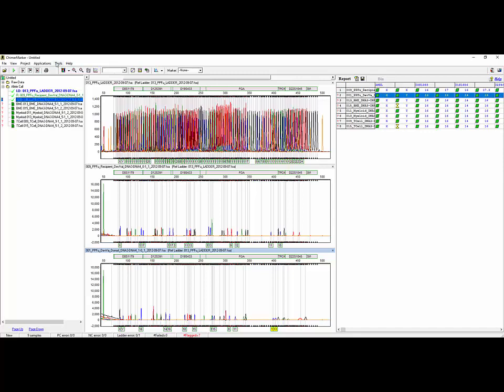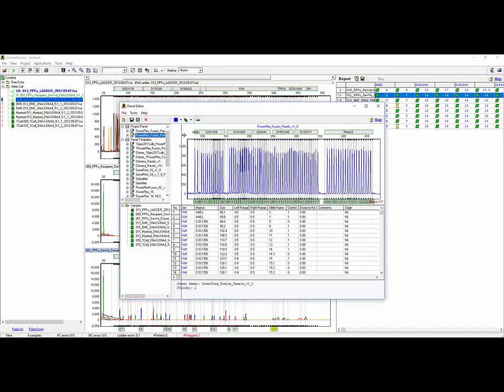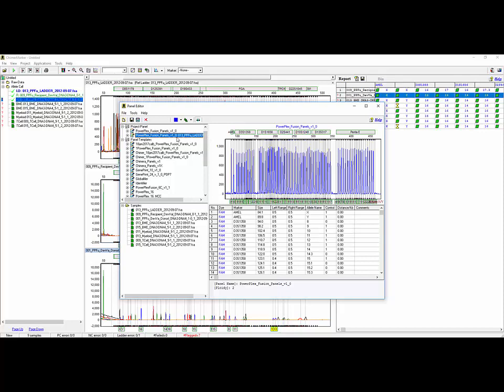Once you've done that, you can navigate to Tools, Panel Editor, where we can save our calibrated panel. And we know that this is the calibrated panel because it's going to list the ladder file after. So you can open File, Save as New Panel, and then enter in whatever you would like to designate this panel as your calibrated panel. And when you click OK, it's going to be added to our panel templates list, and we can access it from the Run Wizard. So let's go there now.